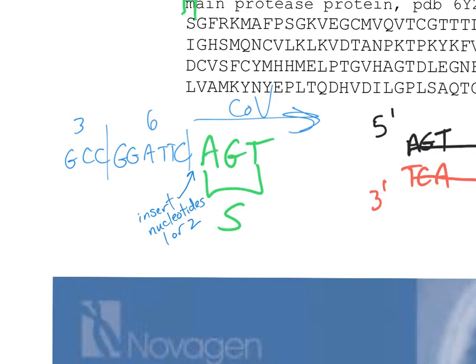And really what you want to make sure is, as you go through, whatever the frame is, I basically draw 3 around these, like this is BamH1, this was the frame from the plasmid, and I go, yep, then that's good. I just want to make sure AGT is in frame. If AGT is in frame, then I'm good to go, and I don't have to worry about the other end because I'm going to put a stop codon on it. So it doesn't even matter.